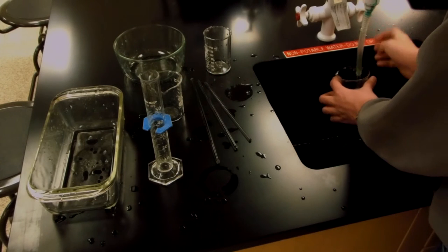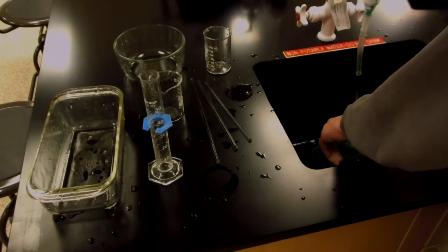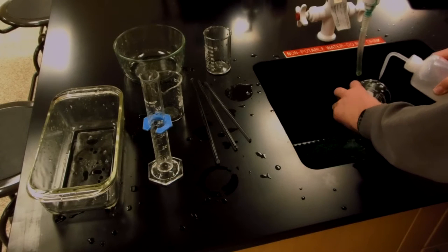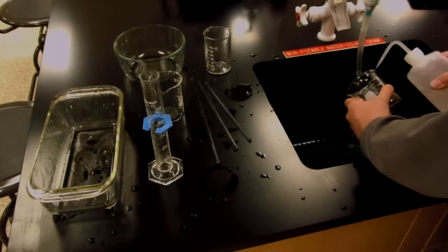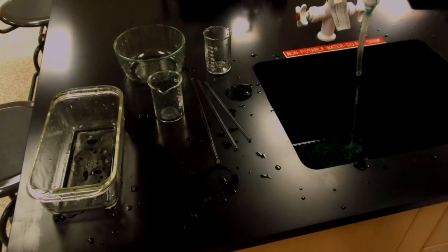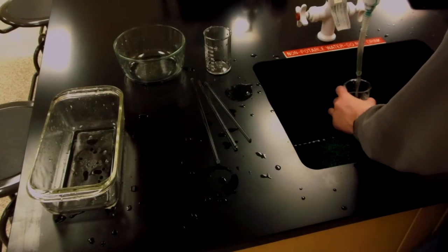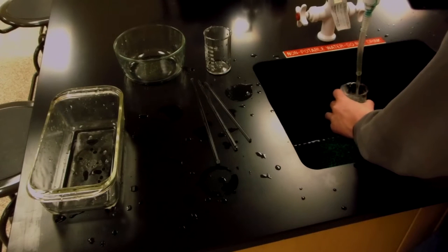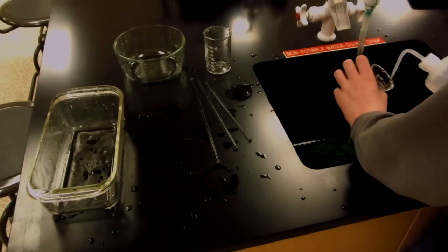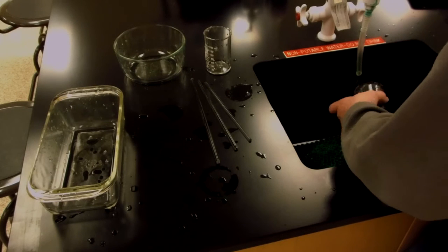Rinse with water, followed by a cleaning with baking soda, both on the rim and inner surface. And I put that on a cart that is behind me that is currently not visible. I repeat the process on another beaker. So as you can see, I rinse it, then I use the wash bottle on all parts of the glass and dump it out.